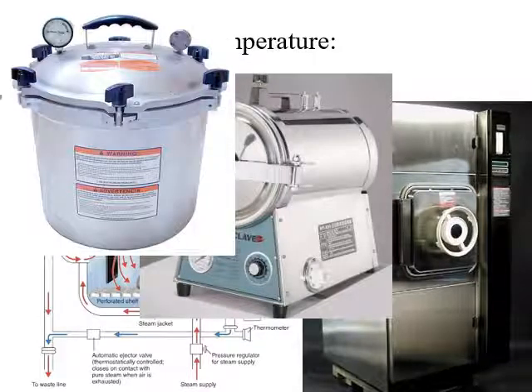This is a very cheap autoclave that's meant to be put onto the stove. It just heats up the water inside and keeps it at a certain pressure, and it has a safety valve which will open up and let some of the pressure out. We have one like this in the Columbia College biology lab for sterilizing our microbiology plates after the biology 110. This is cheaper, not as good, not as flexible. You can't do as many fancy things with this, but it does work to sterilize instruments.